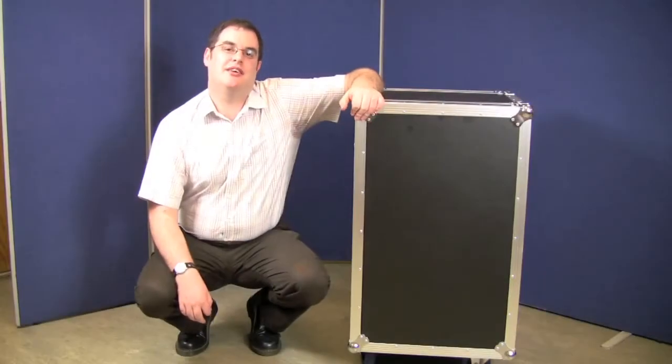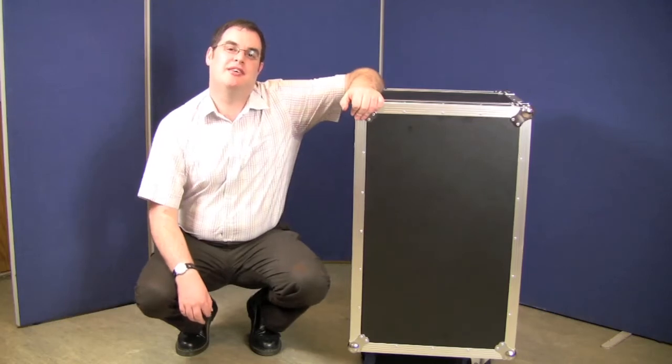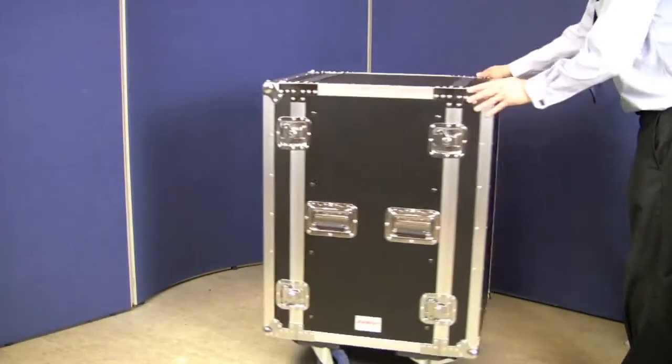Everything's fitted into a transit case so it's nice and easy to take to site in the back of a van, take it off the van, wheel it to site and get going.